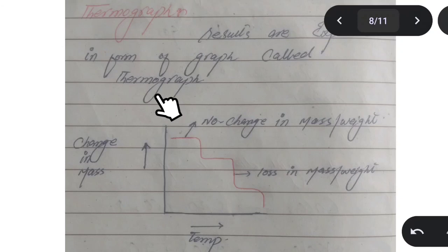When we have performed thermogravimetric analysis, the results are presented in the form of a graph. This graph is known as the thermograph. First of all, we have to understand that the abscissa, or x-axis, of this graph represents the temperature, and the y-axis represents the change in the mass. As I move upward, the mass increases, and as I move downward, the mass decreases. Similarly, as I move toward the right side, the temperature increases, and toward the left, the temperature decreases.